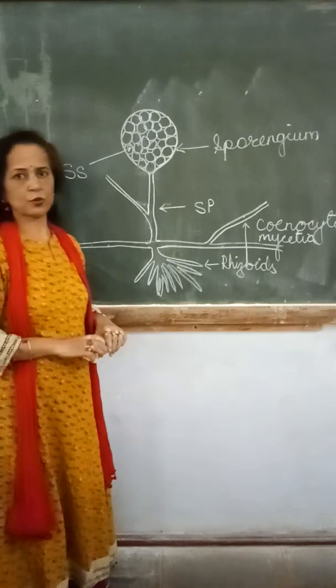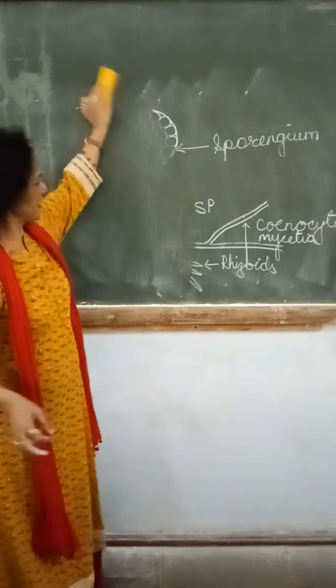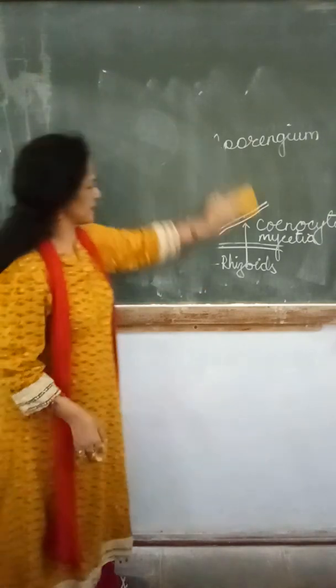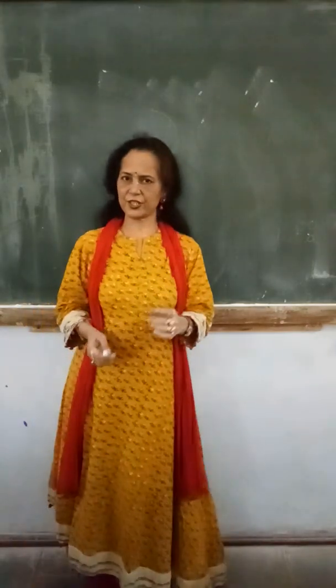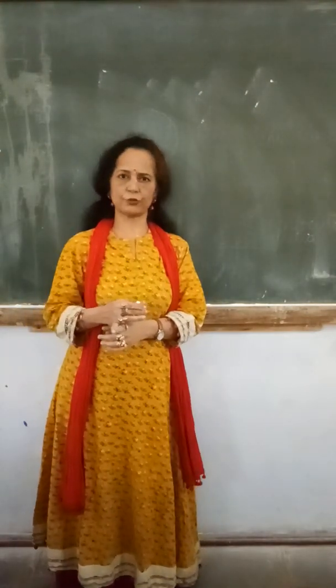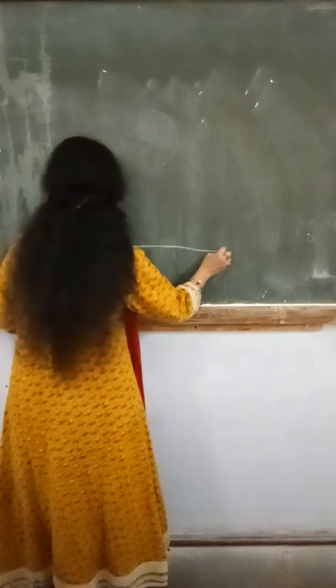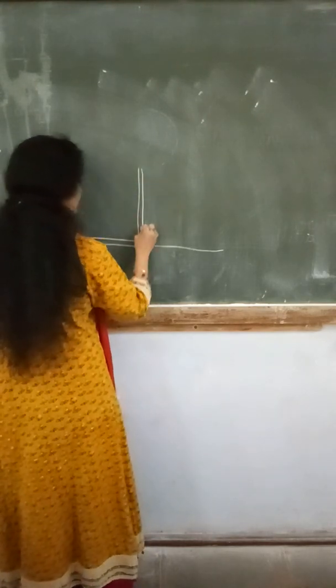Now we'll switch over to the next genus, and that is Aspergillus. In the case of Aspergillus, it is considered a higher fungus. Now we will draw the structure of Aspergillus as it looks under the microscope.